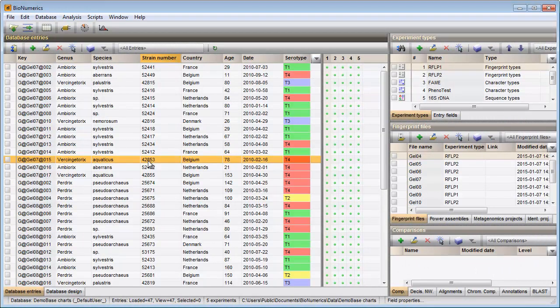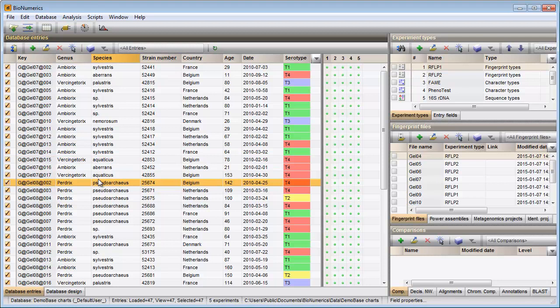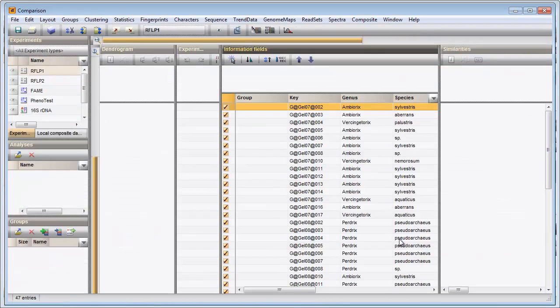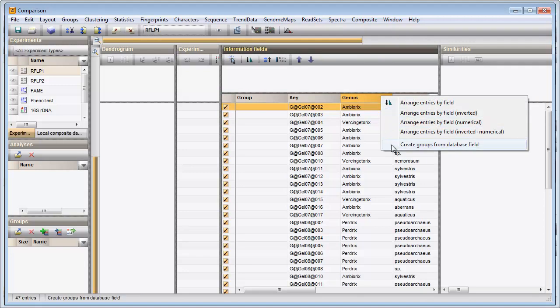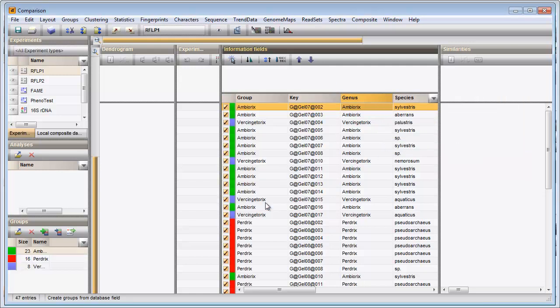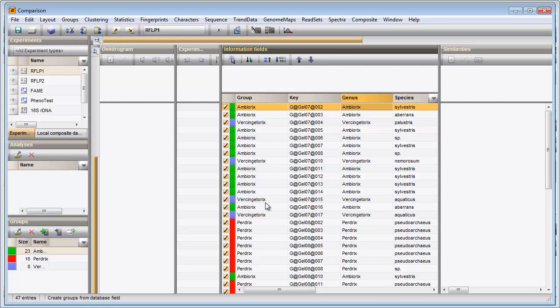I will now create a profile chart that plots the values of a selected character for all my entries. I select all entries in my database using the Ctrl-A shortcut and create a new comparison by pressing this button in the Comparisons panel. All entries that were selected are now loaded in the comparison window. I will now create groups based on the content of the genus field. I right-click on the field, choose the last option and confirm the creation of groups. The groups, the number of group members, and the group colors are summarized in the Groups panel.